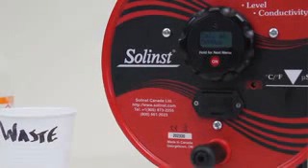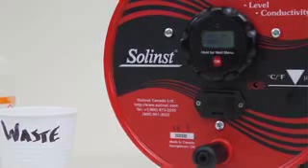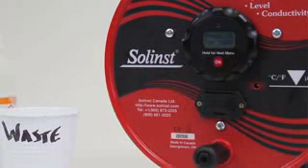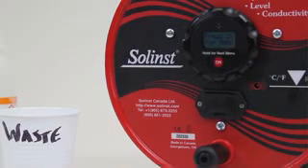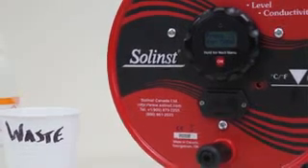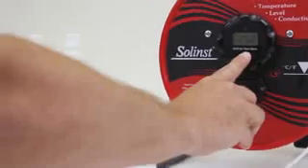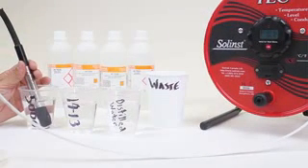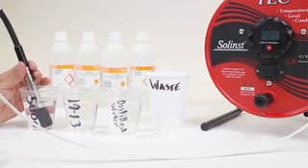Now I'm at calibrate for 5,000. So to accept that, I go to the next screen, which will give me the instruction to press 2 times to lock in that calibration. So I'm going to carefully hold the probe in place and press once, twice. It's waiting while it writes that information, and now it's gone back to the main screen.